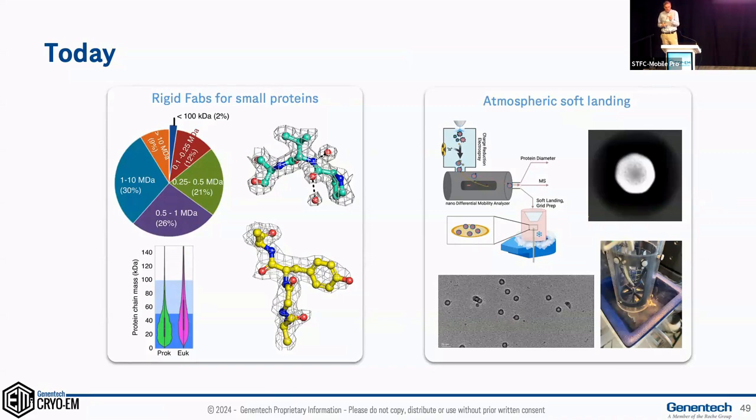to you and you're going to study it over time, it may be worth investing in a sort of antibody discovery or panning campaign to get some binders. And then you can rigidify them. We're going to publish exactly the recipe for which mutations you should put in. And then you can try it with CryoEM rather than crystallography. So that was story one.